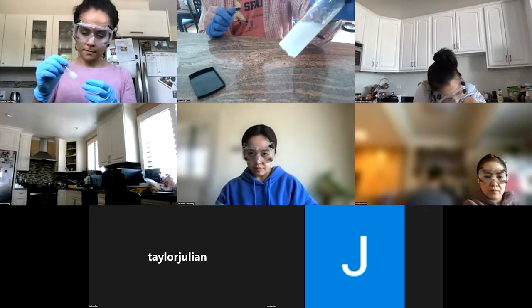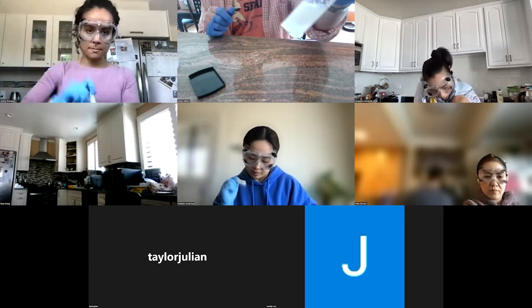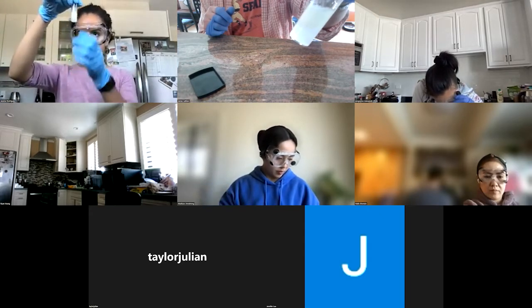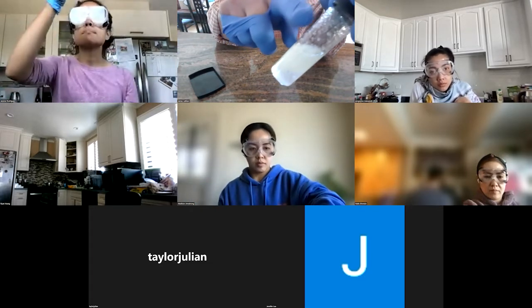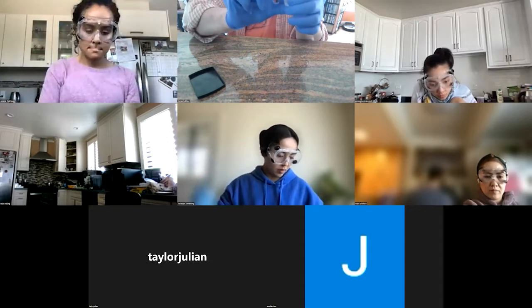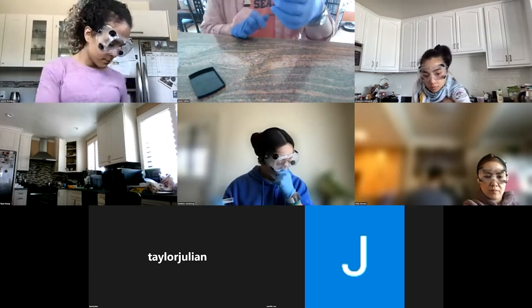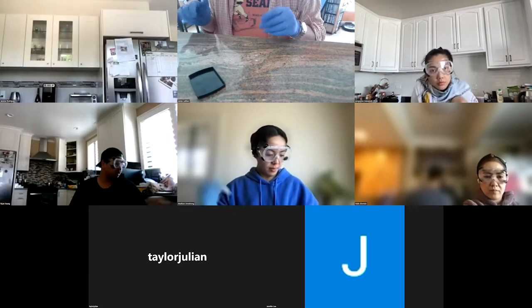But yeah, definitely starting to see a reaction take place because the color's changing slightly. And we're starting to get bubbles where we didn't really see bubbles before. So we've made a tiny bit of soap already, but this is a fairly slow reaction. All right.